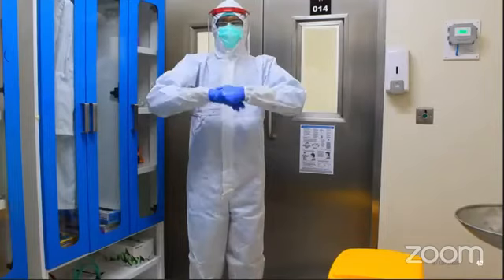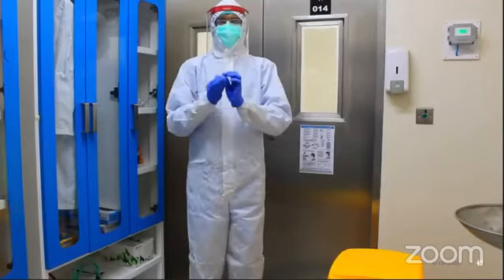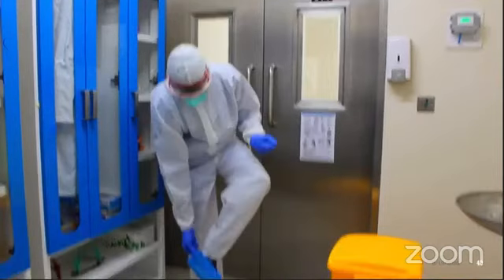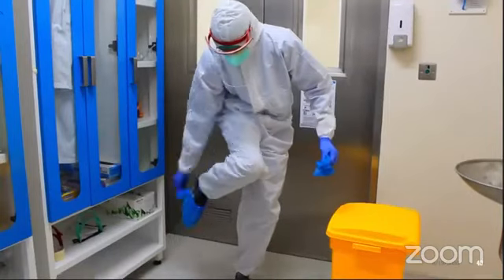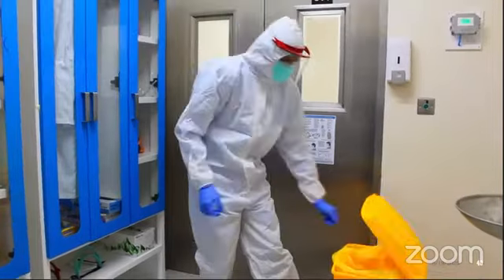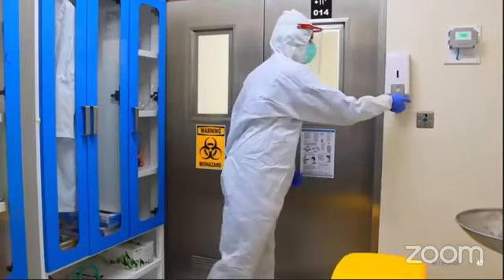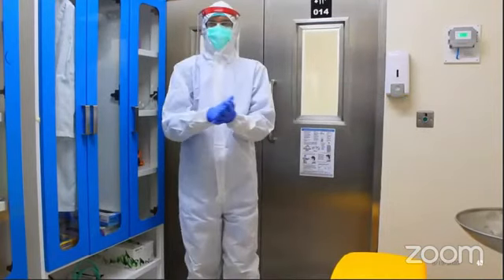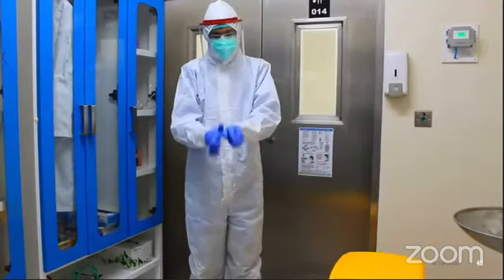Now, the PPE should be taken off in a designated PPE removal area, the doffing area. Disinfect the outer pair of gloves. Remove boot covers and discard them. Now disinfect the outer glove and remove the glove.